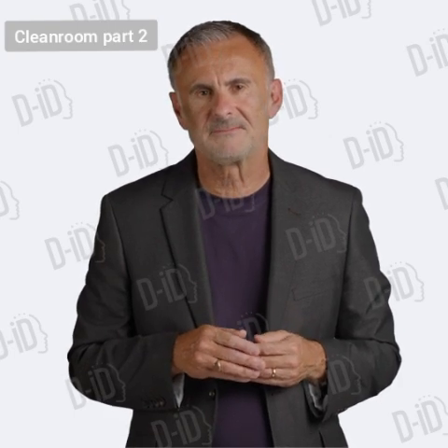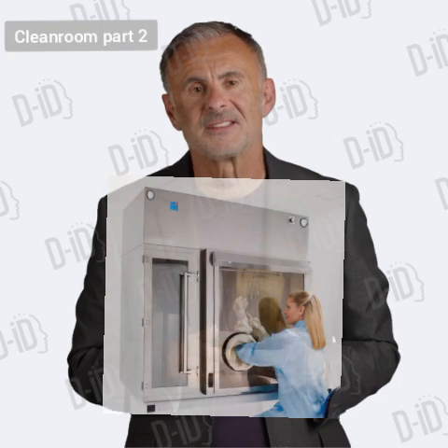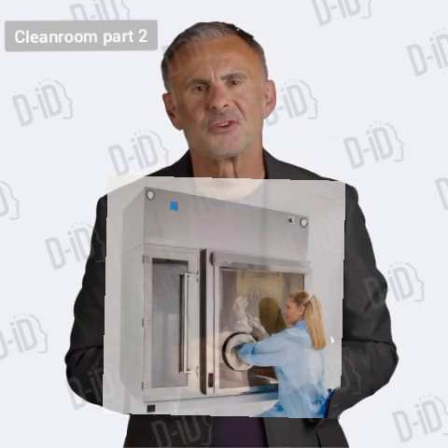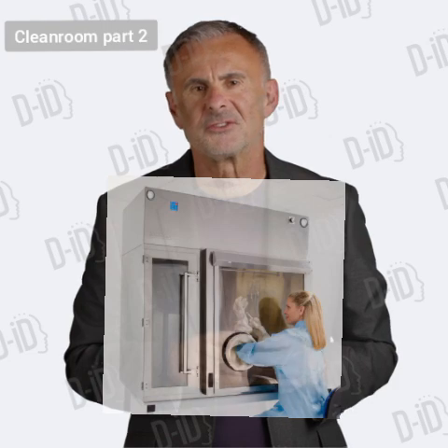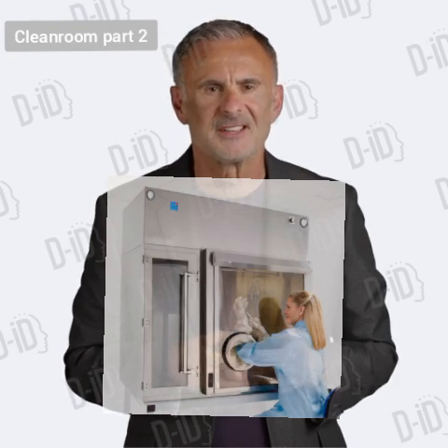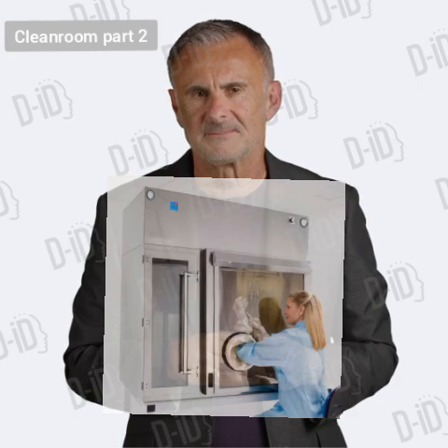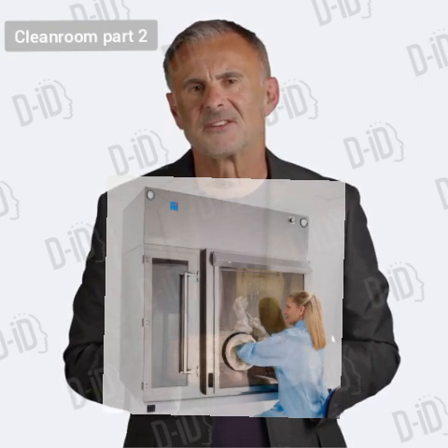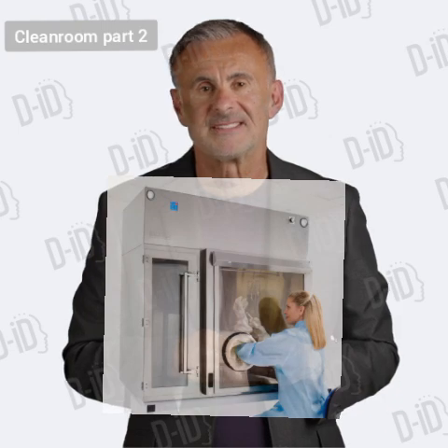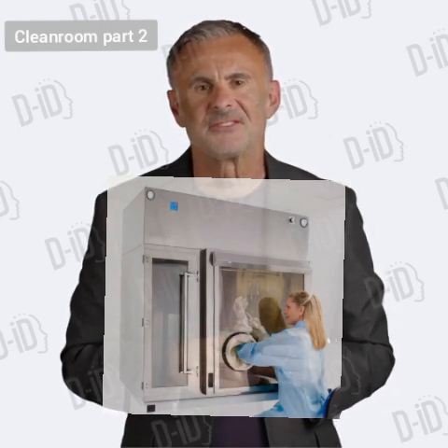3. Mixed flow. Isolator or mini environment do not principally depend on airflow for isolation but use walls of SS and fiberglass. In the pharmaceutical manufacturing area, this technology is generally known as isolator or barrier technology, whereas in the semiconductor industry it is generally known as mini environments. SS laminar flow glovebox or isolator, LFGI, falls under this category.